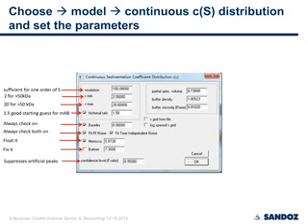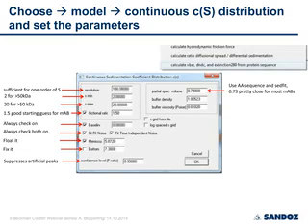Okay. The partial specific volume and also the refractive index increment and the extinction coefficient can be computed in Sedfit. You find it under options, loading options, in calculator, VBAR, the refractive index increment and extinction coefficient from protein sequence. It's pretty close to 0.73 for most monoclonal antibodies, so I'll leave it at this default value.